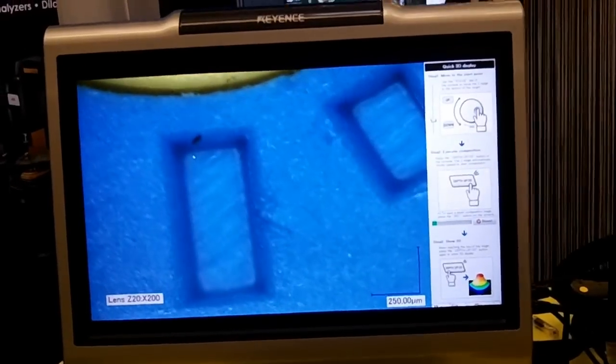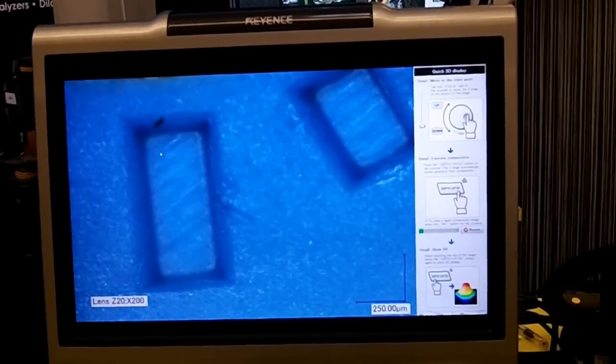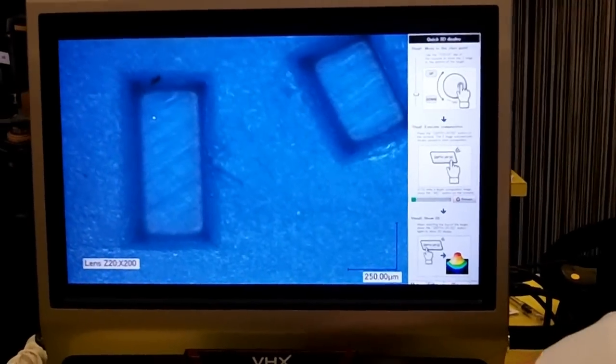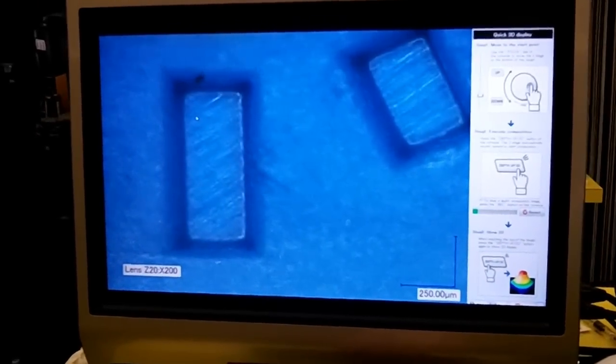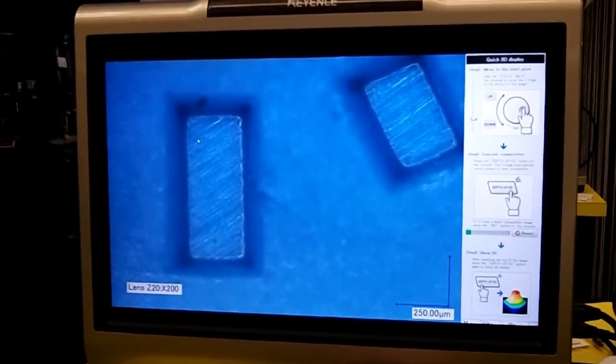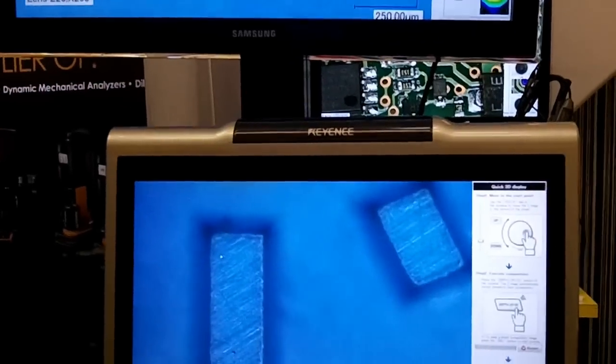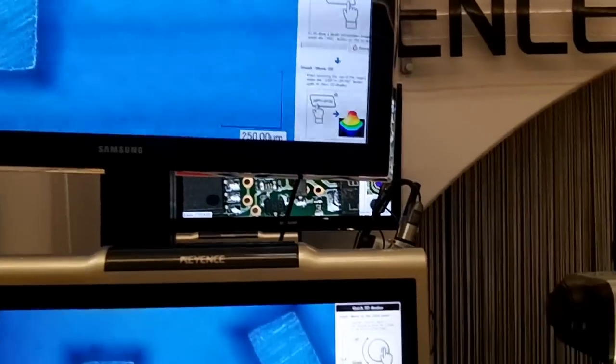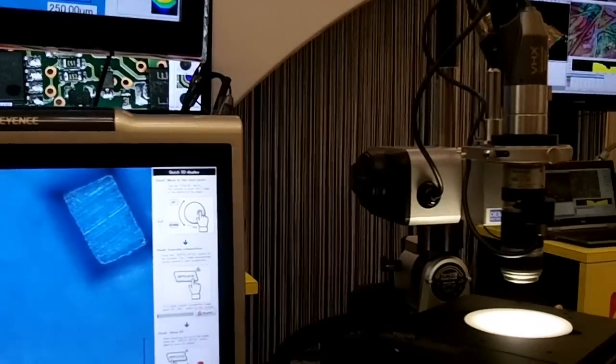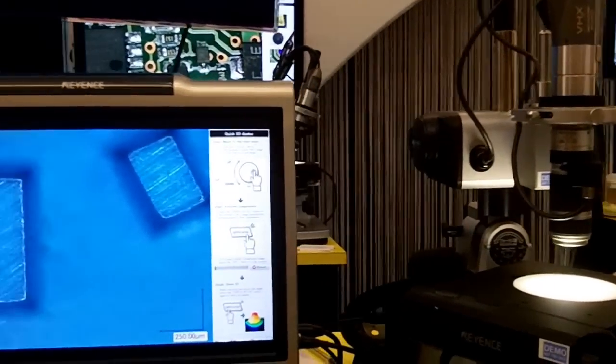What are we looking at right now? So right now we're looking at a trim pot, and we're just looking at one of the indentations here at 200 times magnification. We can see that we're getting different areas that are in and out of focus. With this microscope, we can actually scan through the different layers, and as it scans it will take the in-focus regions and generate a composite image for you in real time.